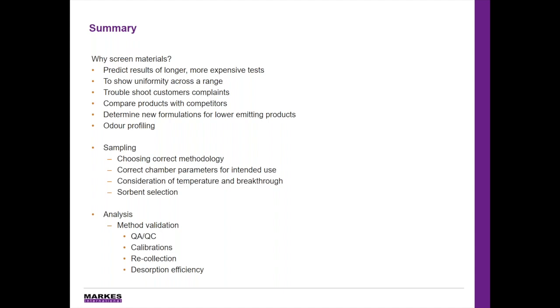It also allows you to troubleshoot some of the customers' complaints and compare your products with competitors. It helps determine new formulations for low-emitting products. We also mentioned that odors in some countries are very important and a big concern, so we also want to show what the odor emissions look like with different materials.